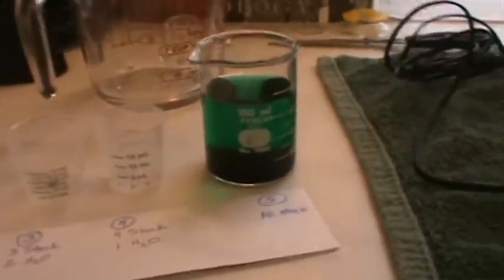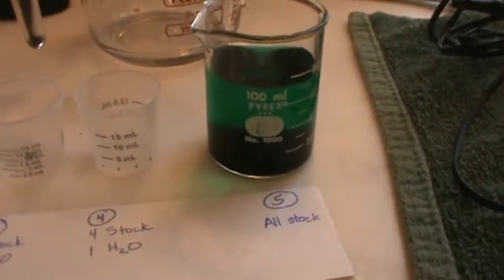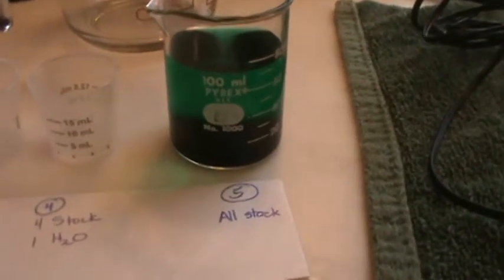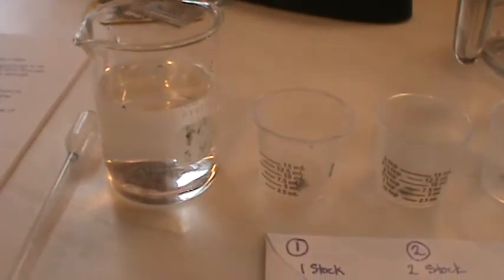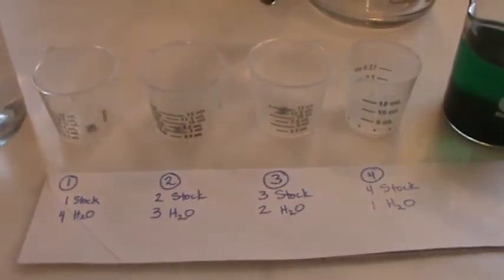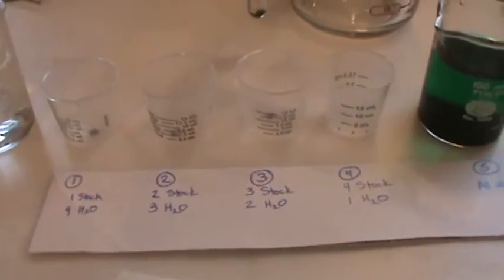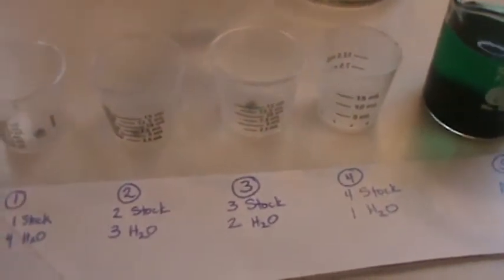Okay, so now let's take a look here. Right here you can see I have what's called a stock solution. And a stock solution means it's the solution that we are beginning with. And this one is going to be number 5, it's all stock. Okay, and then we have on this side, we have water. And then we're going to be doing a series of dilutions. So this is getting a little ahead of us. We're going to be doing a lot of dilution chemistry in chapter 4, but today is a good day to see it before we learn it. And we're going to have solutions that match.